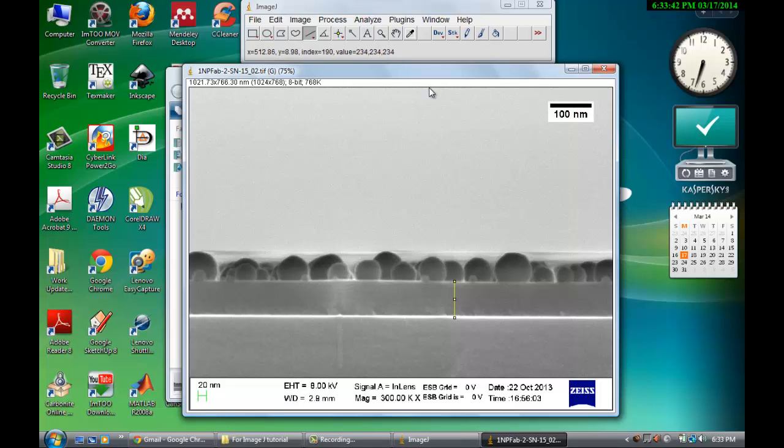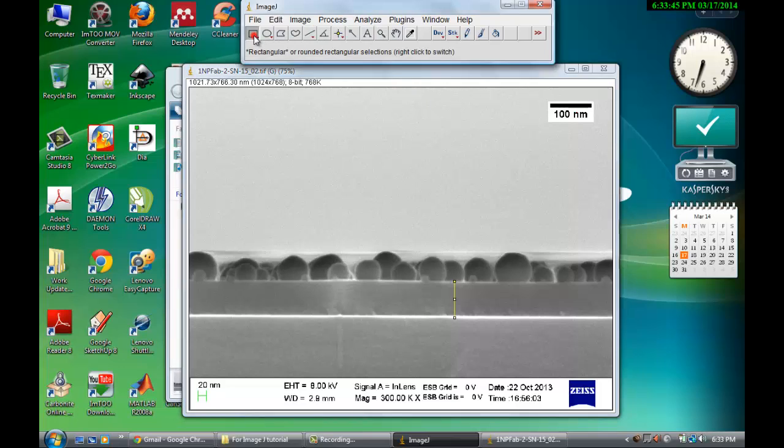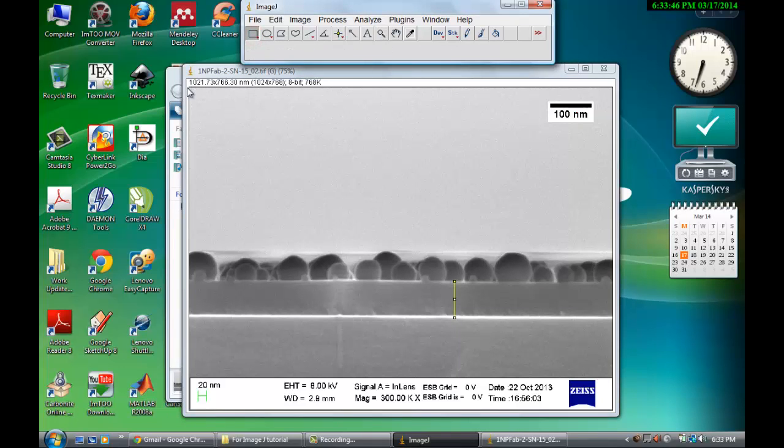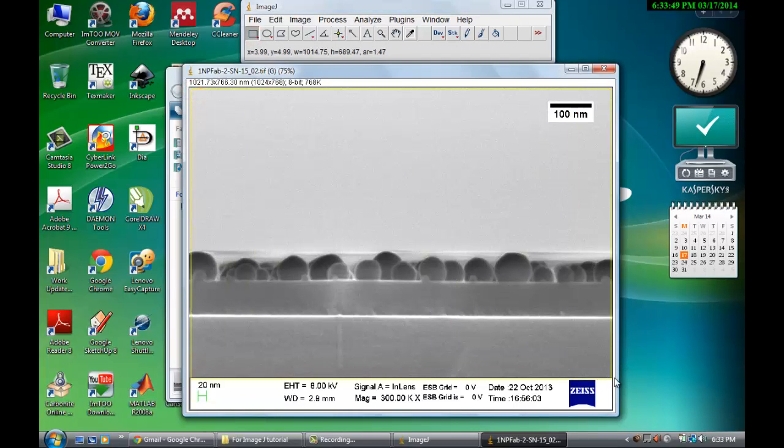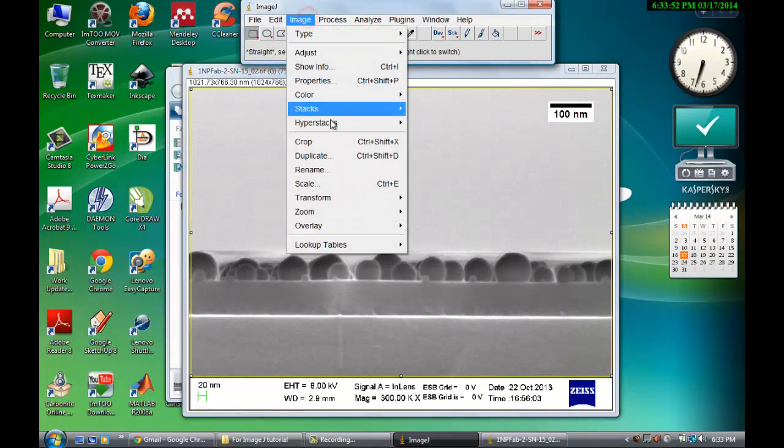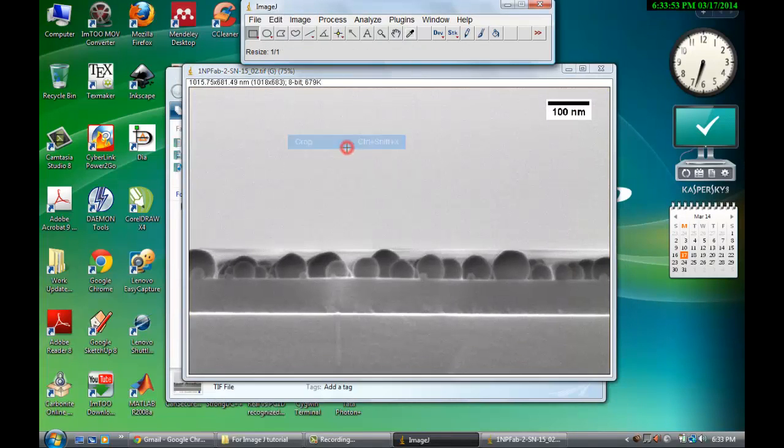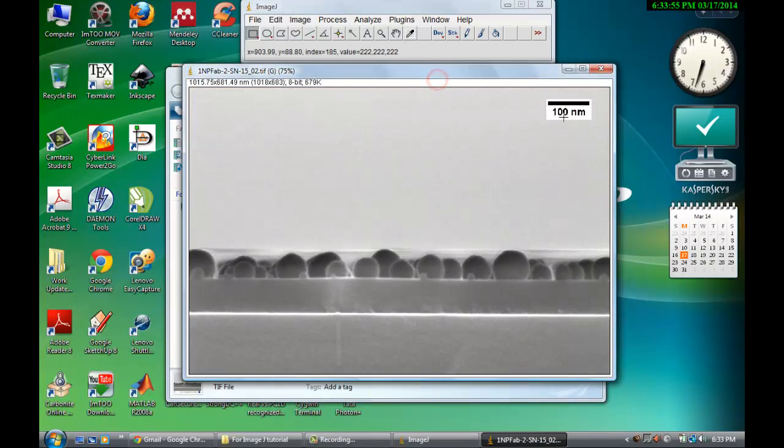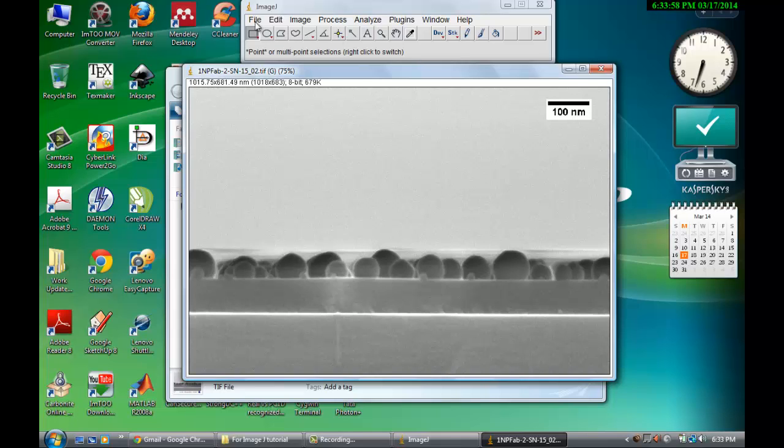Now what you can do is it is selected. Now what you can do, just show the image how much you want to show for the publication. Go to Image, Crop. Now this is cropped.